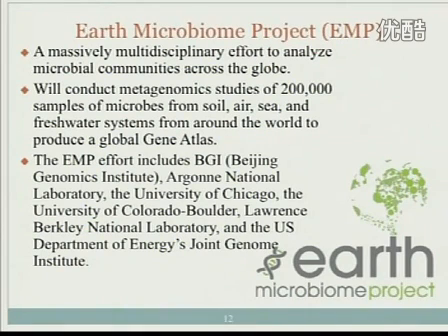So when you talk about 16S, you mean if this is a group of soil, if I have, let's say, 10,000 species in there, they have differences in the 16S? Yes. Right? Yes. But you mentioned that you want to do the amplification, design primers. How can that work? Yes. So 16S RNA genes are the most conserved gene family. They're very conserved. That makes it possible to design primers so that you can get 16S from all different species. Not really all, but close to all.